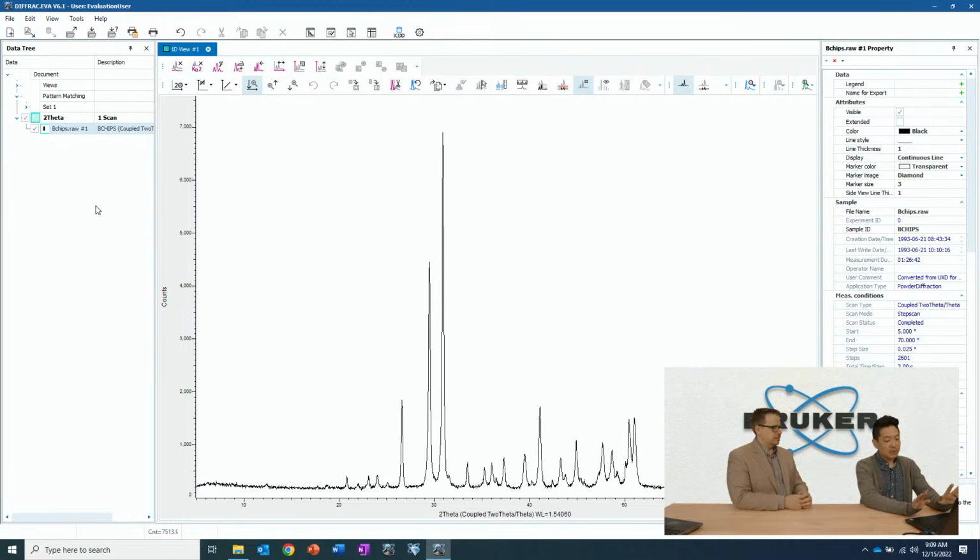If you insert a bunch of peaks or you do area calculations, all of that will then flow down from here. So it's kind of like a lot of graphics manipulation software where you have this parent-child relationship. Yeah, we kind of saw a similar layout actually in DIFFRAC.TEXTURE, and then we saw that in XRR the other day. Oh yeah, I forgot about that one. So we got that there, and then in the middle we've got the plot. The actual data itself. And then on the right-hand side is going to be our properties.